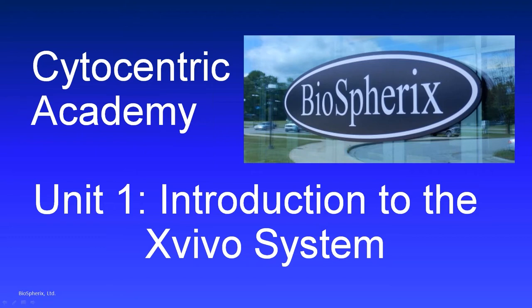Today we're going to be going through Unit 1, talking about the different types of modules that go into the Xvivo system and how they all work together to protect your process. But first, we're going to talk about what makes working in the Xvivo system fundamentally different from anything that you've done before.